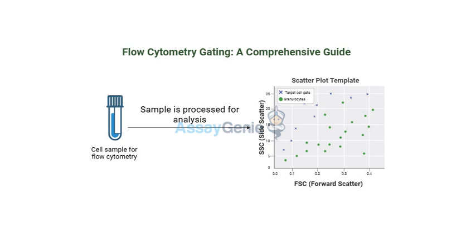The information we get from flow cytometry gating actually has real world uses. Absolutely. Think about it. Understanding how the immune system responds, developing drugs, figuring out if someone has a disease, is the treatment working, all that. Flow cytometry is at the center of it all, both in research and in actual medicine.